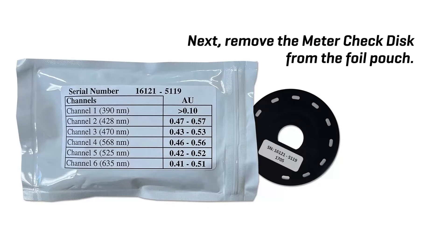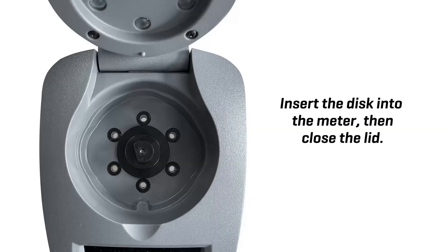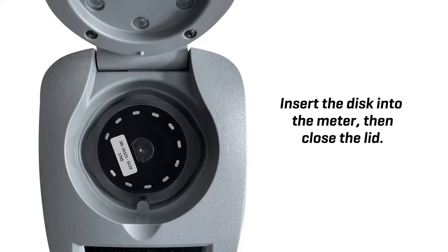Next, remove the meter check disk from the foil pouch. Do not remove the black cover from the disk. Insert the disk in the meter, then close the lid.